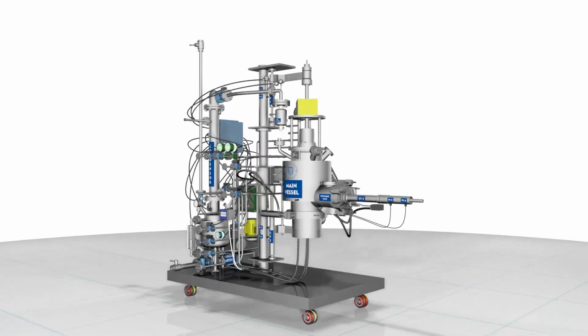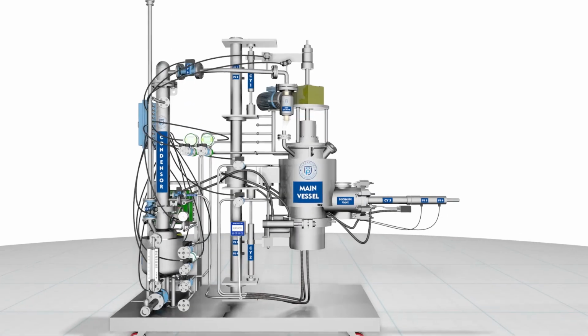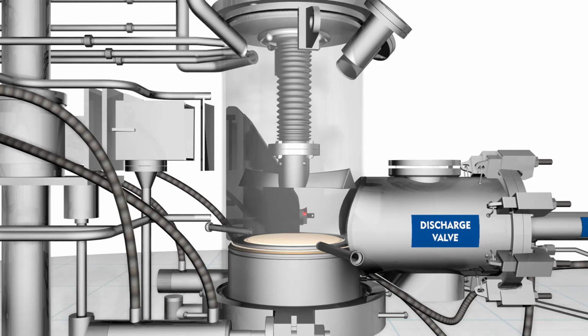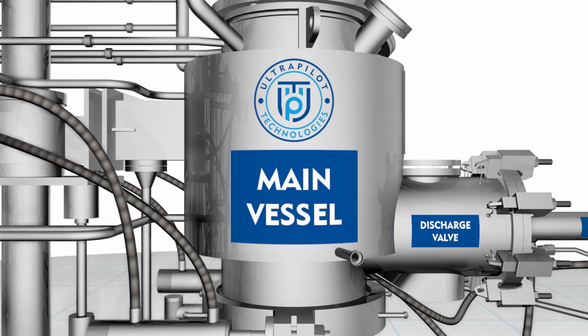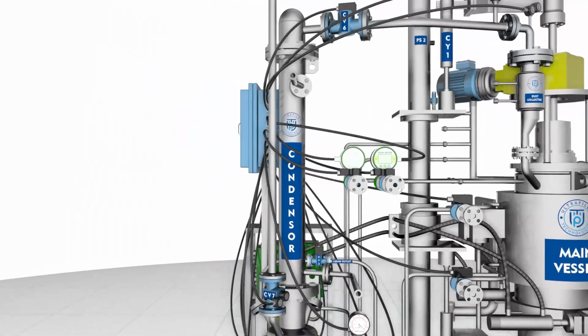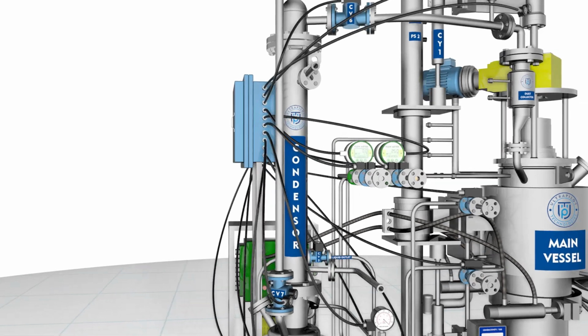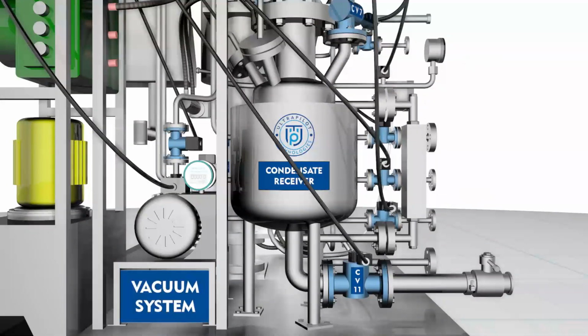The components of the system are: first, the main vessel. Second, condenser. Third, condensate receiver.